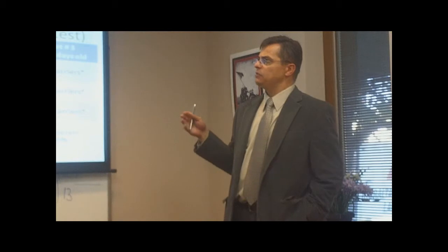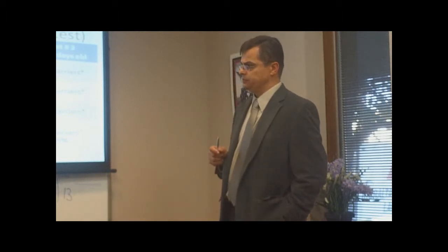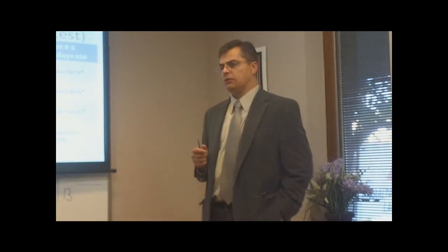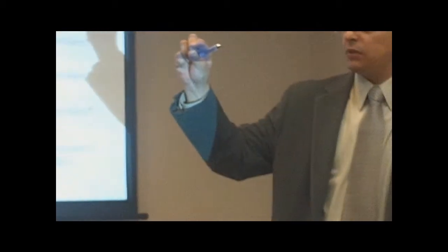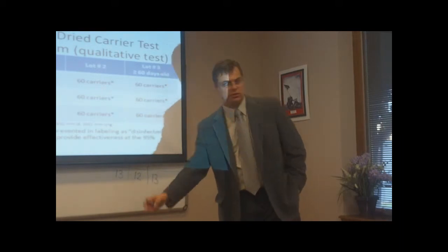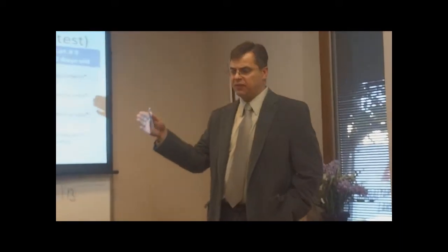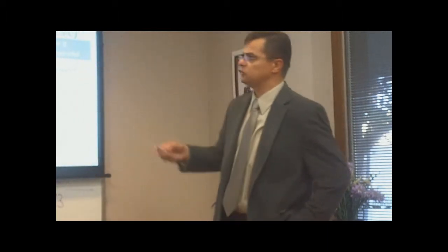Once your disinfectant reaches that specific temperature, you have to, at the same time, prepare your culture. Your culture has to be 48 hours old. And once you remove the 48-hour culture, you take 20 or however many carriers you're going to perform in a day. The requirement is 20 carriers per test tube, and you need to immerse those 20 carriers into 20 ml or 25 ml of suspension, depending, to make sure that 100% of the test tube and all 20 stainless steel carriers are covered with the specific suspension.